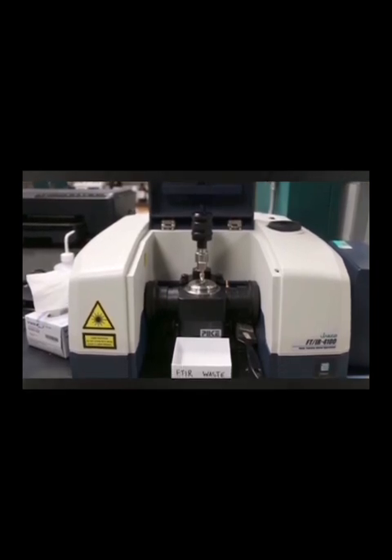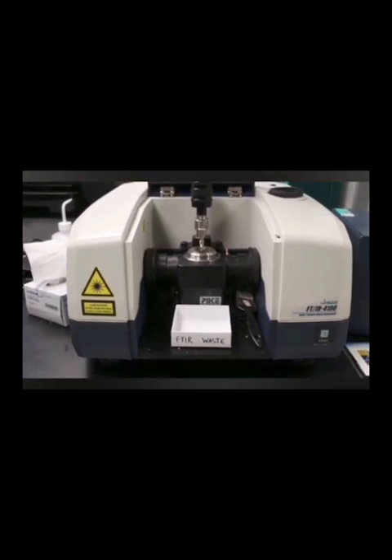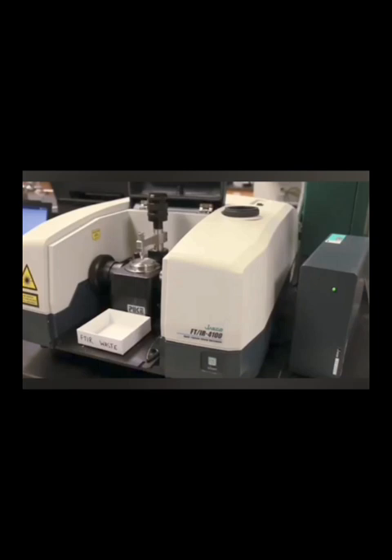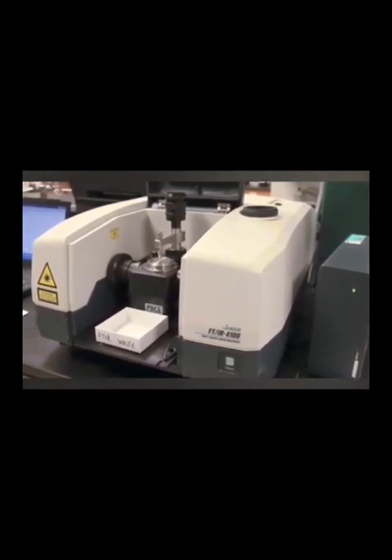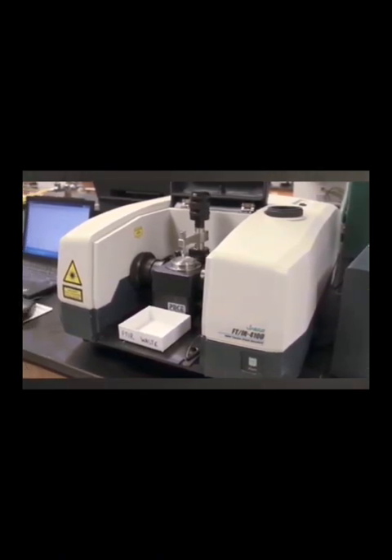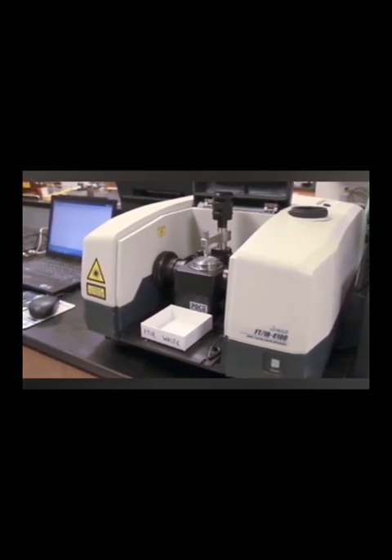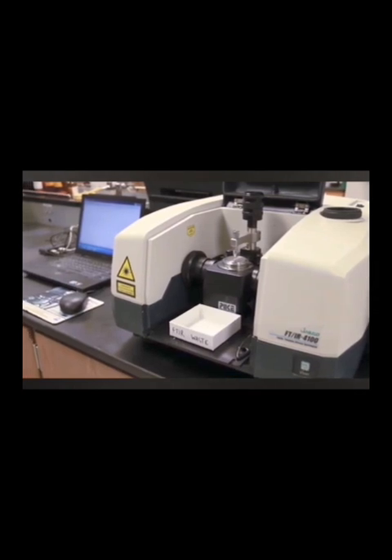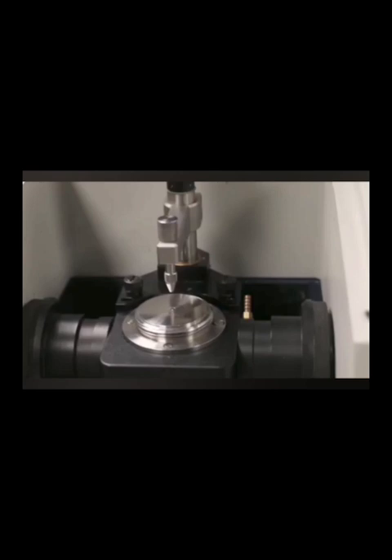How does FTIR work? The FTIR instrument sends infrared radiation of about 10,000 cm-1 to 100 cm-1 through a sample, with some radiation absorbed and some passed through. The absorbed radiation is converted into rotational or vibrational energy by the sample molecules. The resulting signal at the detector presents as a spectrum, typically from 4000 cm-1 to 400 cm-1, representing a molecular fingerprint of the sample. Each molecule or chemical structure will produce a unique spectral fingerprint, making FTIR analysis a great tool for chemical identification.